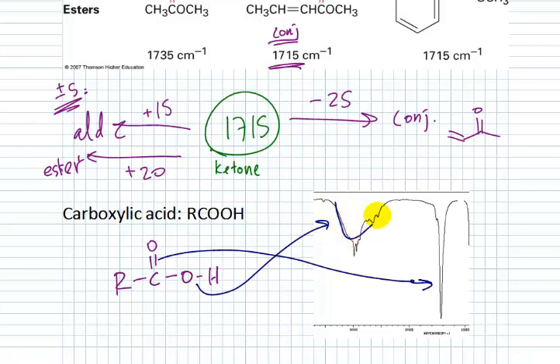It'll appear as a broadening of really the whole region between say 3500 and 2800 or so. So don't look for a specific little alcohol broad peak right there. Look for broadening of that entire region, which is characteristic of carboxylic acids. Again, with ATR, like we have, there will be less absorbance in here, but you'll still be able to see some sort of broadening in this region for the presence of carboxylic acids.